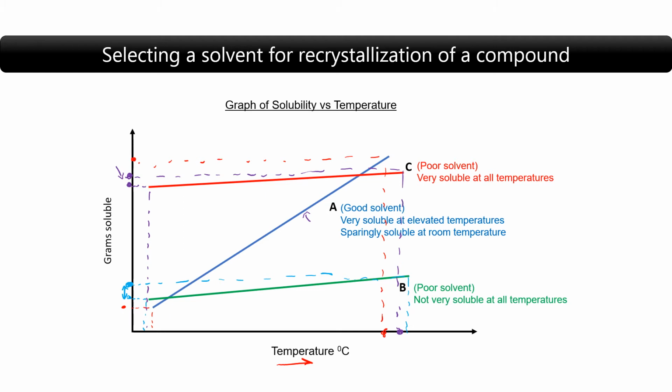So when we have to choose a good recrystallization solvent for a particular product, we would look at the polar properties of the compound versus the solvent and make an educated guess what could be a good recrystallization solvent for that compound of interest. And if we have a few options, we would select them by trial and error.